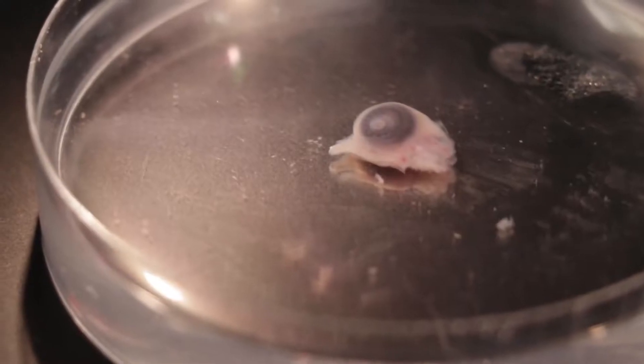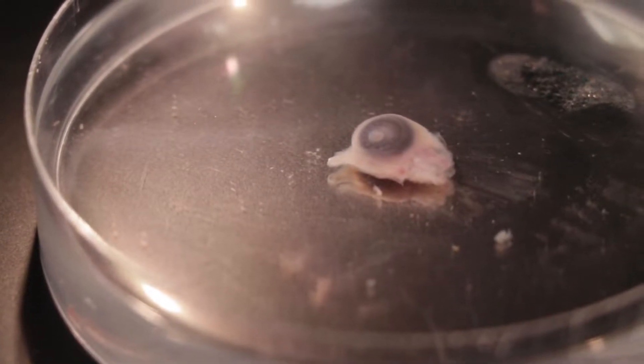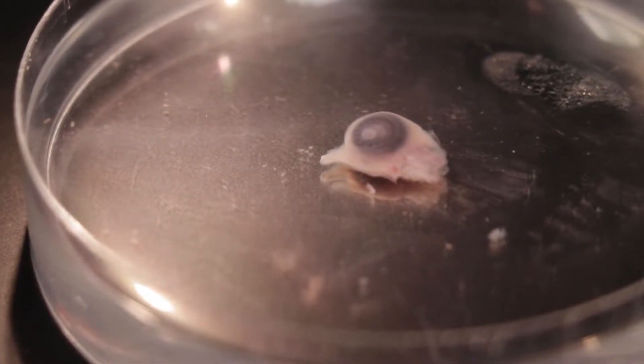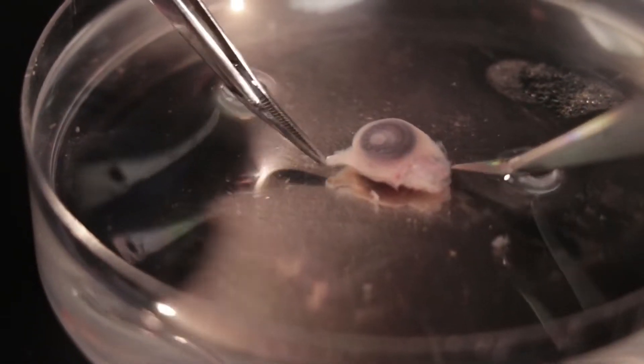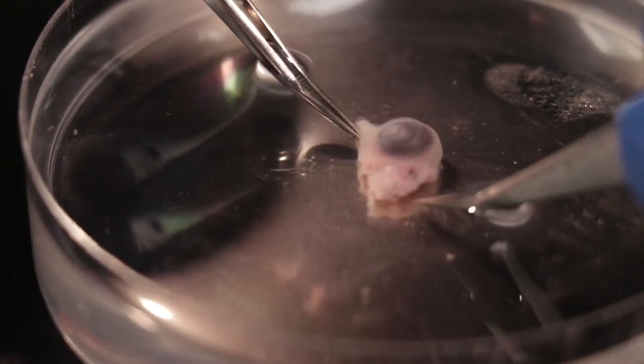With the chicken head in autoclaved chick saline, bisect the chick head in the midline, leaving some tissue intact around each eye. The extra tissue will help the eye maintain some tension in the culture as well as assisting with nutrient uptake throughout the eye.